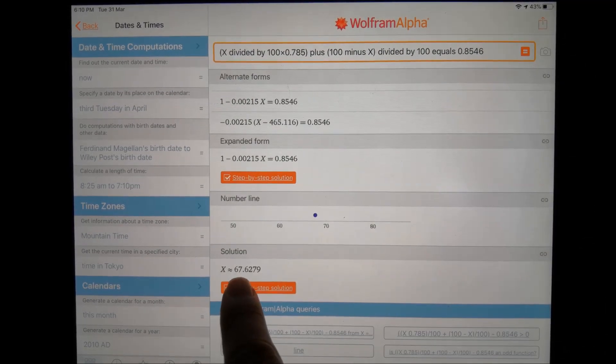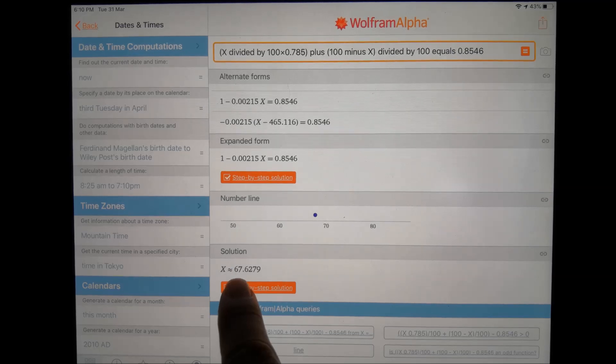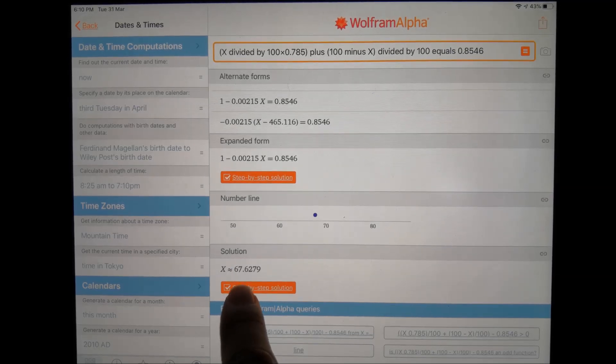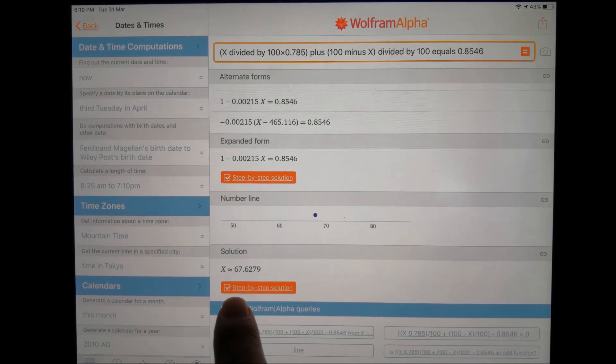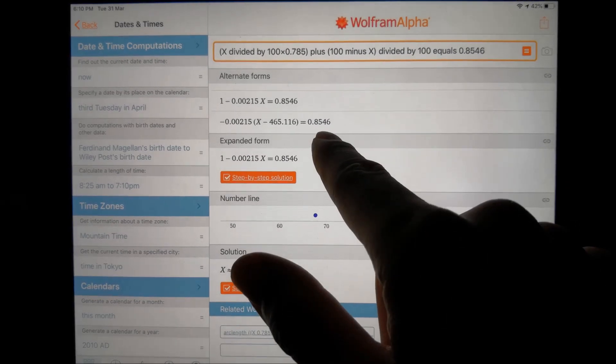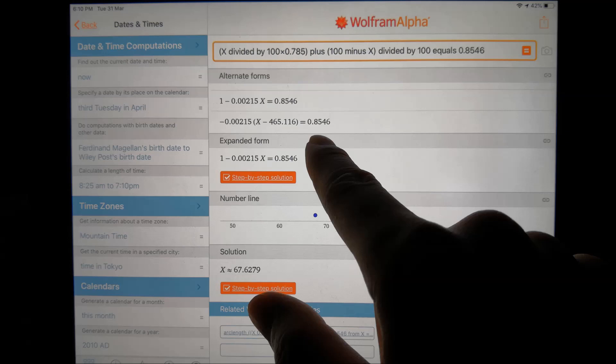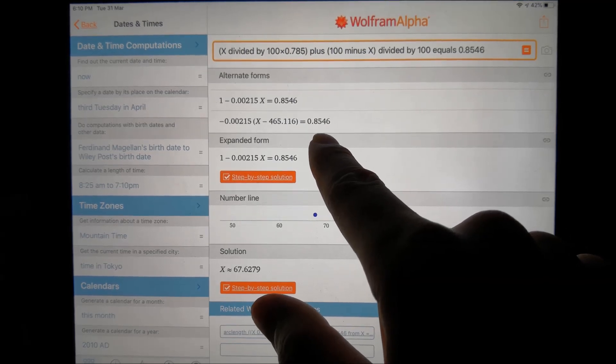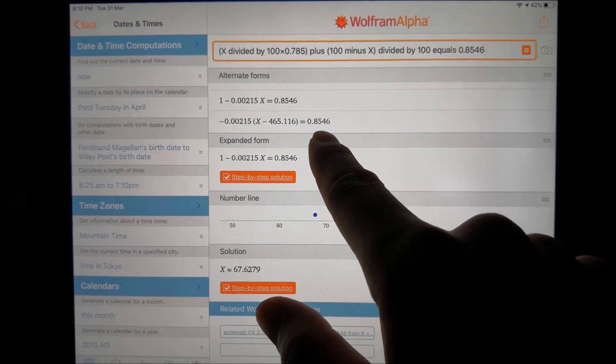Okay. So the computer is telling me that this alcohol is 67.62% isopropyl alcohol. That's, you know, really, it's actually within the margin of error for our calculation, because we measured the 100 mls of alcohol weighed about, had a mass of about 85 grams.